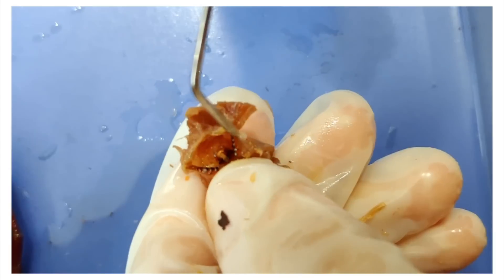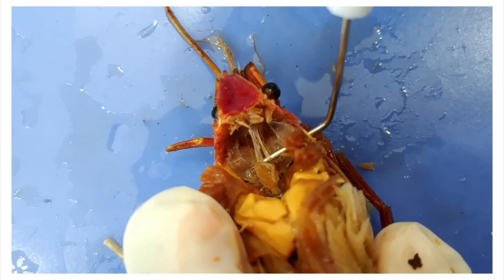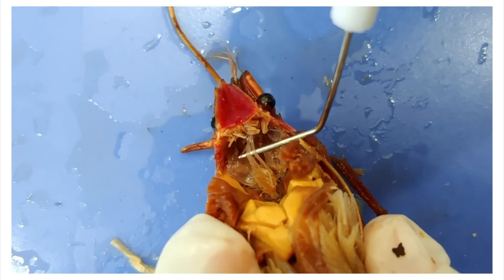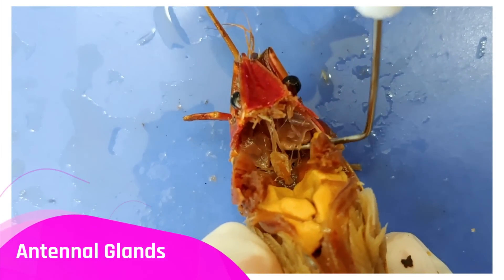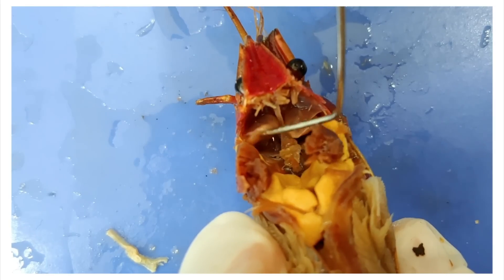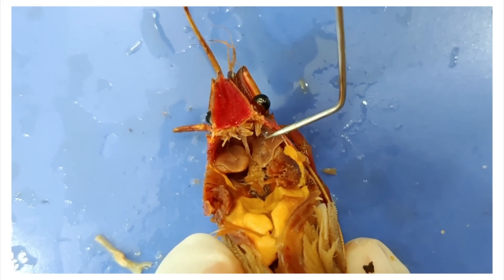Under the stomach, running along the ventral side, is the nerve cord — kind of like the spinal cord. At the end where they meet is the brain, which is very tiny, and the crayfish is perfectly happy as it is. Up here are the antennal glands — there's one there and another one on the other side. This is a weird spot for a kidney to be in, but that's basically what it is: it functions in osmoregulation, regulating the salt and water balance in an organism.